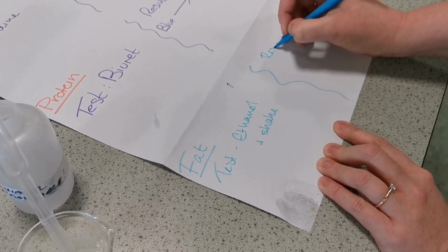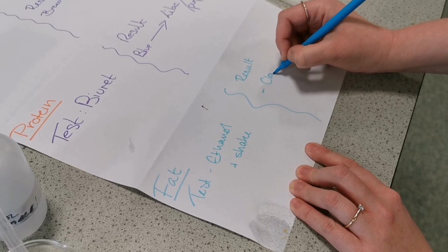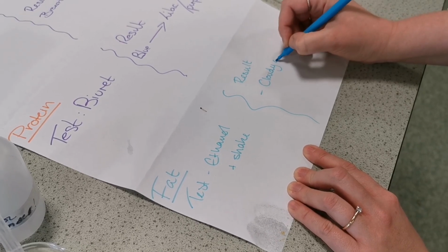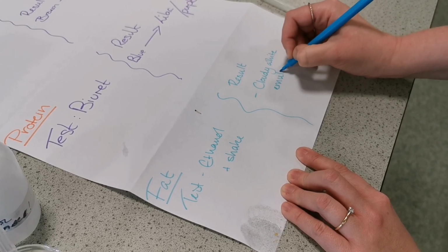So the test for fat is ethanol, and you have to shake it up. The result is you get a cloudy white, what's called an emulsion.